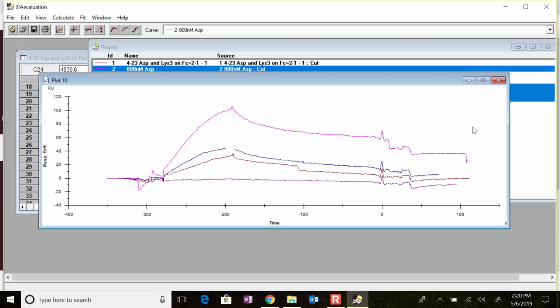Okay. Now the one other thing that's still weird with this data is this little blip right here. This is about the limit. I can still use this data, but it'd be nice to have another injection, and we do have other injections, but I'm just going to show you what this one looks like. Now we've got our data lined up in the X direction. It's starting here and it's stopping there.